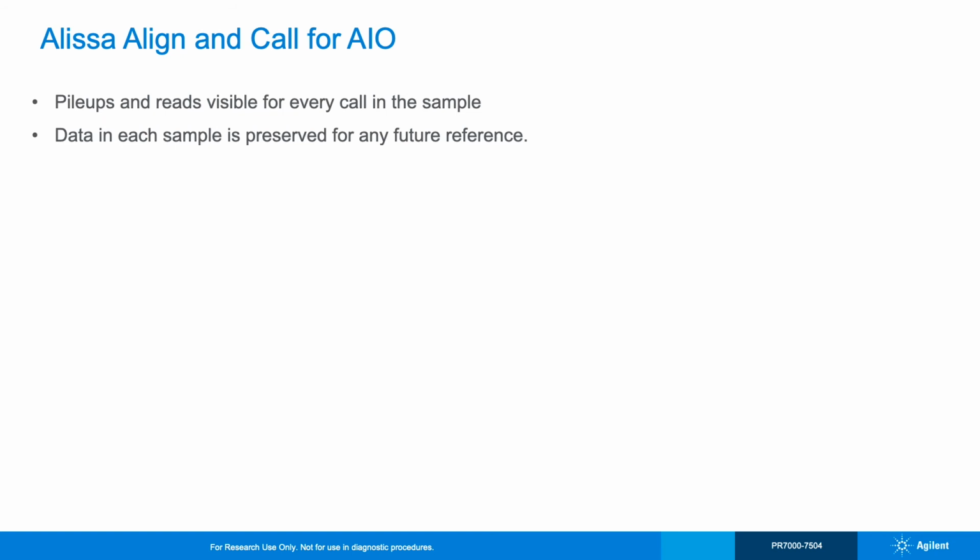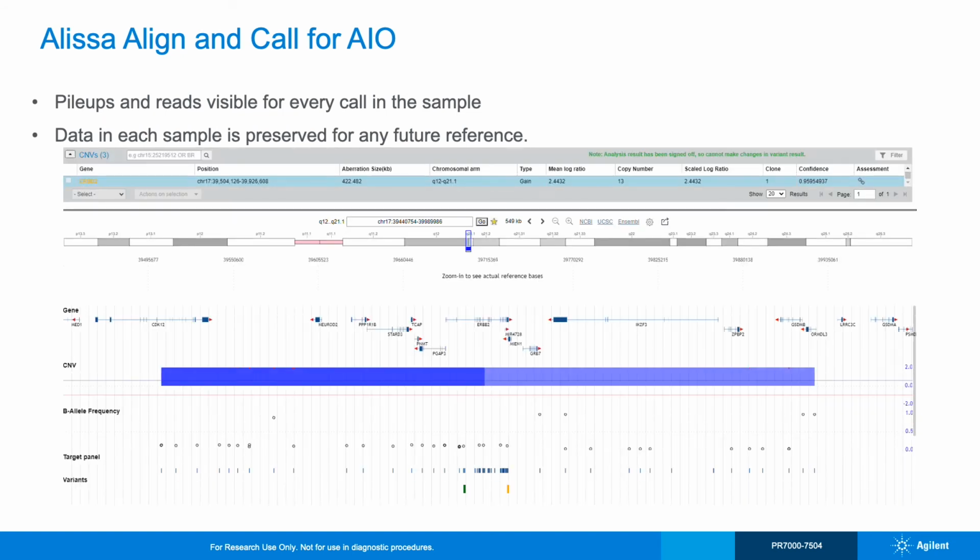For CNVs, what this looks like is more similar to an array profile, where we have the individual reads highlighting, in log format, the potential for being a gain or deletion, along with the total call for that entire region highlighted in blue for gains and red for deletions. This is also an easy-to-read interface that can be accessed throughout the analysis stage.